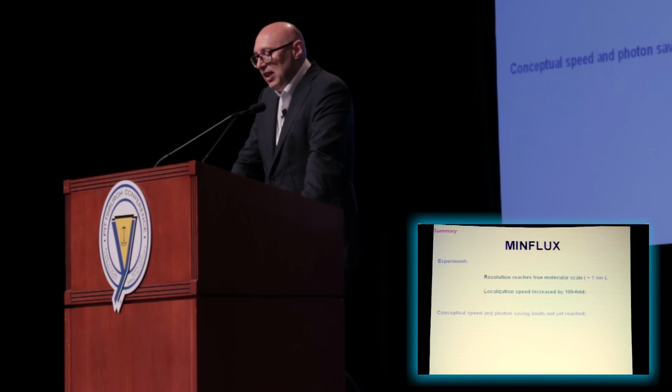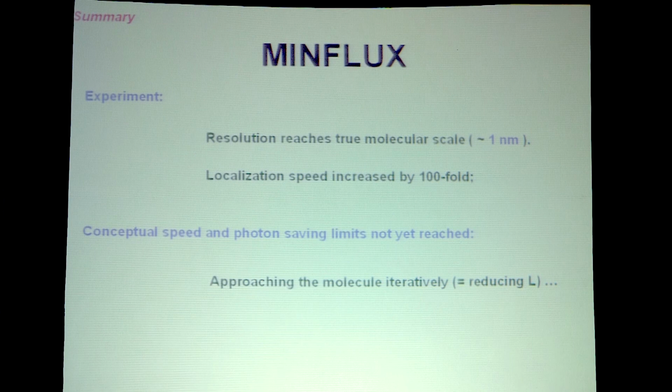And as I said, approaching the molecule position iteratively, which we haven't done in these measurements, will lead to further photon savings, because the 1 over square root of n dependence is fundamentally outperformed. And so this is a very effective way, and I think it's clearly one of the ways of going.